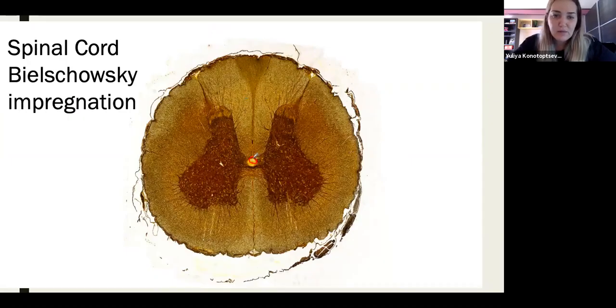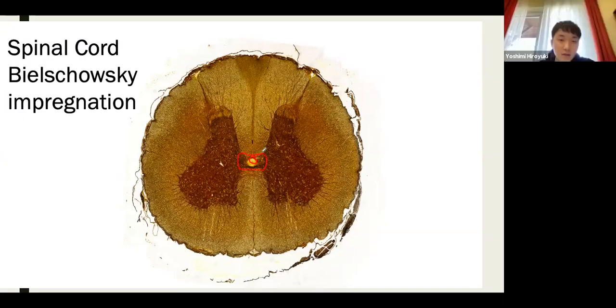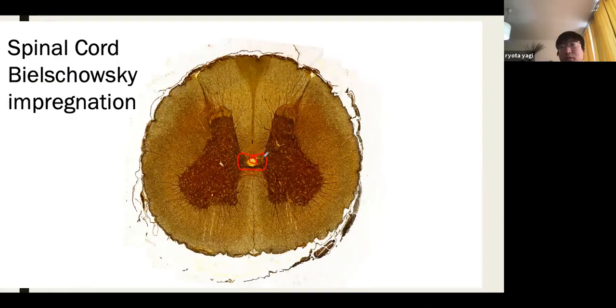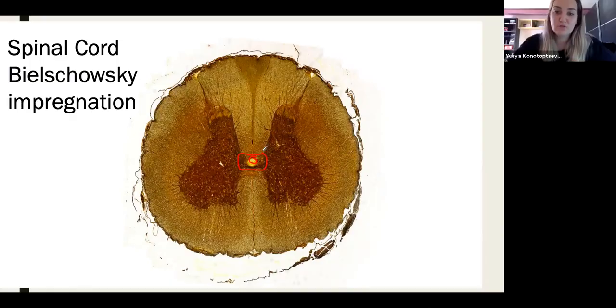So central canal. How do we call this area? Lamina 10. That's where lamina 10 is located. I agree with you, but this area has a name. Gray commissure. Very good. So this part right here is the gray commissure. That's the area that is joining the two parts. The dorsals are here and the ventrals are going to be here. This is the comma tract of Schultze. Sure. What is this?